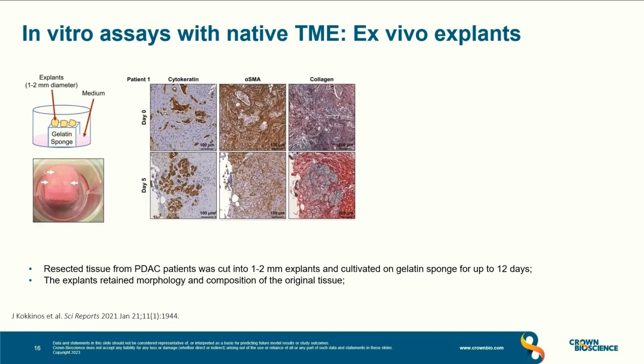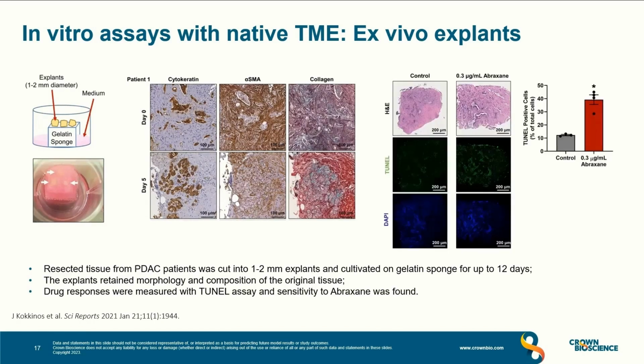The authors showed that the explants maintained the morphology of the original tissue on day 5. Some of the explants were exposed to the anti-cancer drug Abraxane and showed sensitivity to the drug by a TUNEL assay.